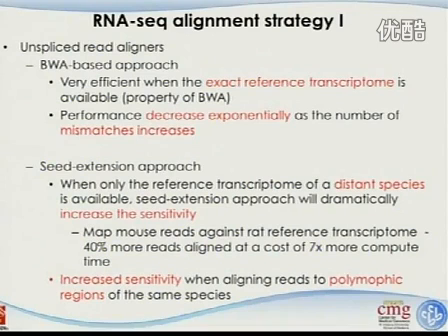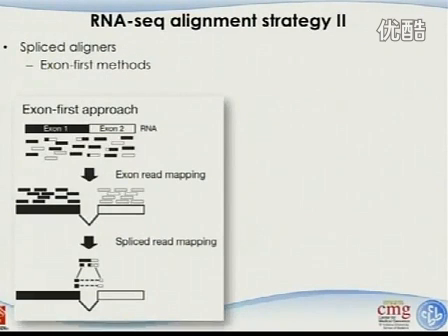One example is that there are so many different rat strains or mouse strains. If you use Brown Norway, you are probably in good shape because the reference genome is Brown Norway. But if you use another rat strain, you may want to evaluate that a little more. In our practice, we also observe the same thing, that BWA will produce a much lower number of reads compared to BFAST. So those are the choices you have to consider.